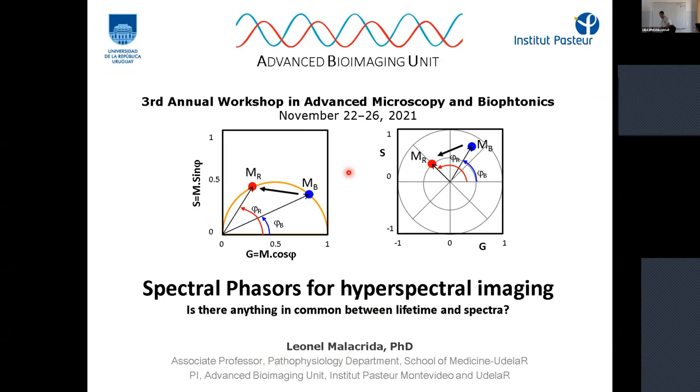Okay, so I am going to talk now about spectral phasor for hyperspectral imaging. The first time that I gave this talk at the LFD, Enrico put this up front, saying, what is in common, and how can we take advantage of the phasor to also acquire and analyze imaging from hyperspectral imaging. And I was working on this even before I moved to the LFD.